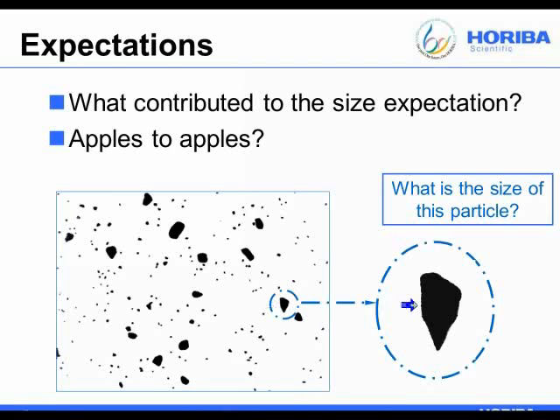And so if you have a sample that looks like this and you're measuring it in a sedimentation analyzer, again, you're going to get something called the Stokes diameter. And the Stokes diameter is going to be a representation of how this particle settles with some force being applied to it. So if you imagine a leaf, the leaf falling from the tree always orients itself for maximum drag, right? It sways back and forth and it falls more slowly than if a cannonball fell out of the tree. Same basic principle. It's simplifying it quite a bit.